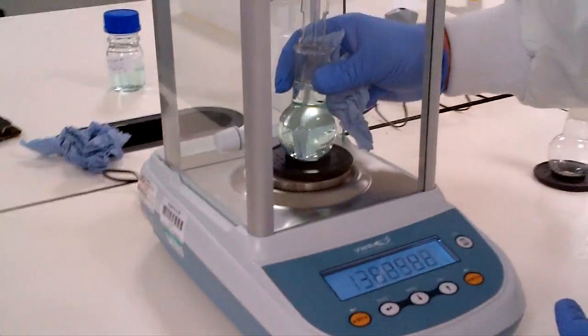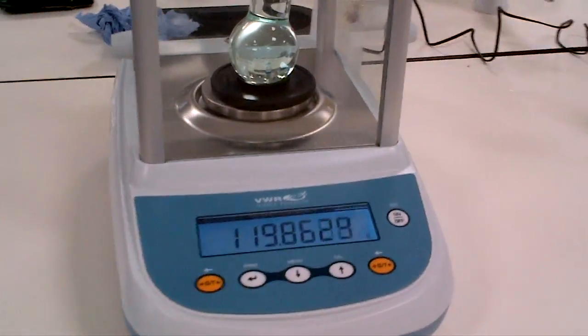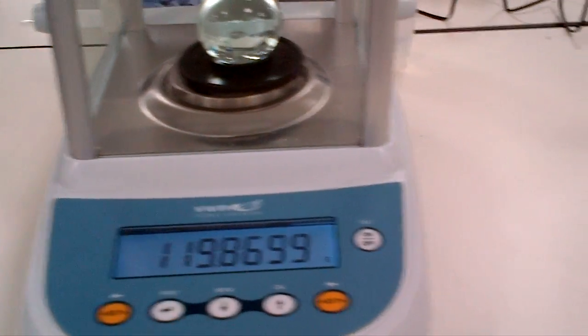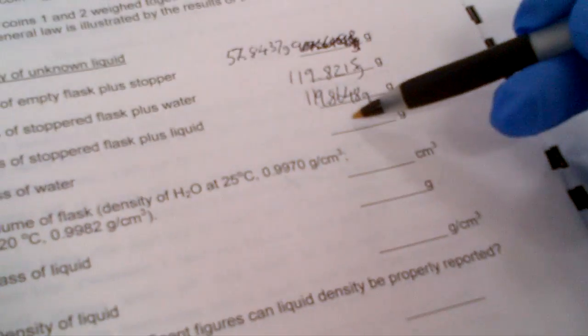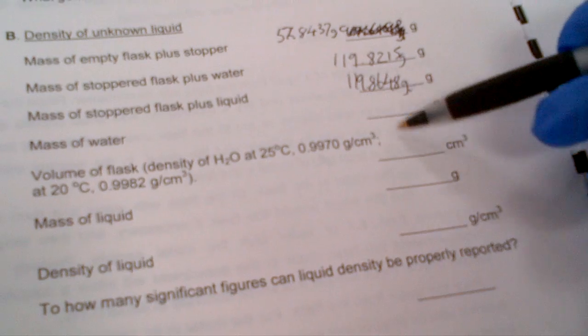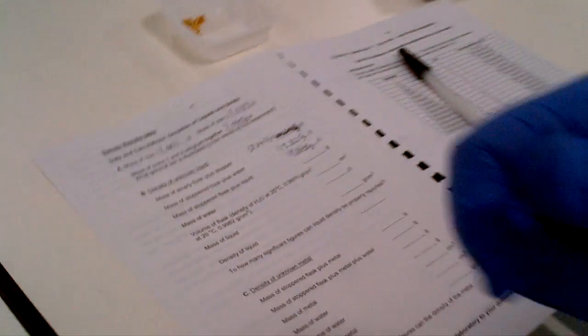Place onto the balance. Now you record the mass of the flask with the unknown liquid, so we'll write that as 119.8648 grams. And this part you can calculate on your own. I'll give you further instructions on the day of the lab how to calculate this, so this is what you're going to do on your own.